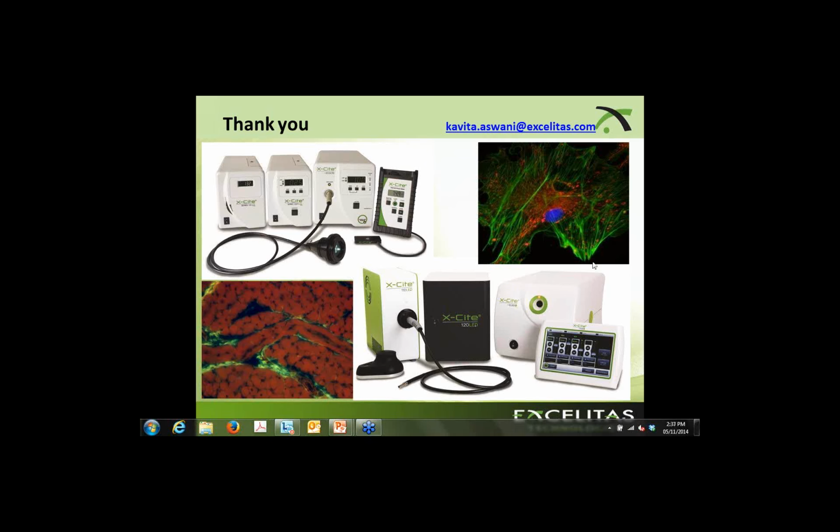Kavita, can you please explain the no filter requirement for LEDs? What I was talking about in that example was basically if you have single, switchable LEDs in your unit, then you can simply filter the excitation at the LEDs within the unit and then have your dichroics and emitters in the microscope. If you could do a multiband dichroic and a multiband emitter, then you wouldn't need to rely on the filter turret in order to do your actual switching between the different.